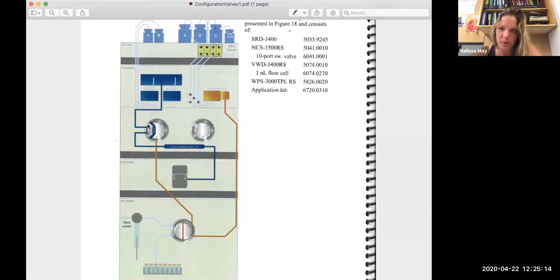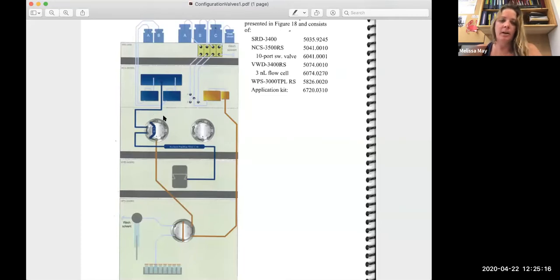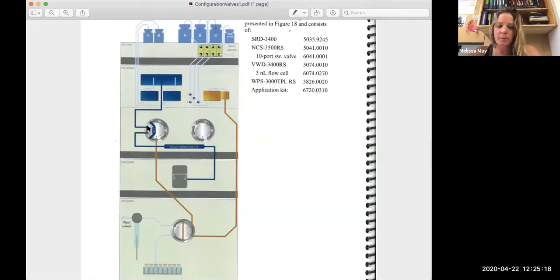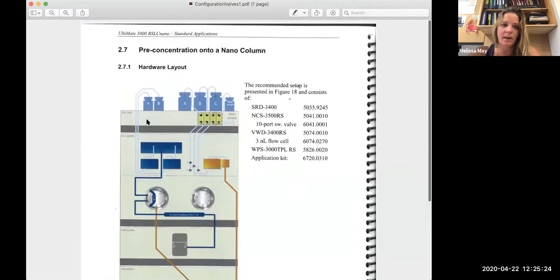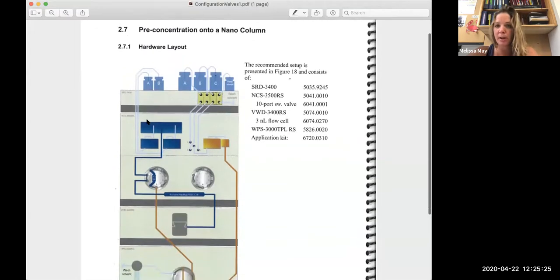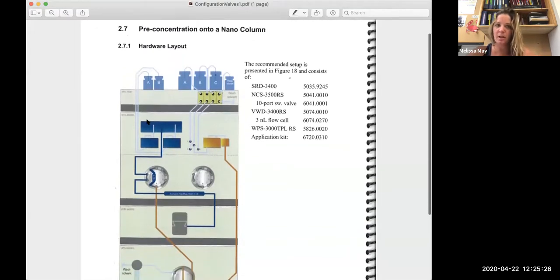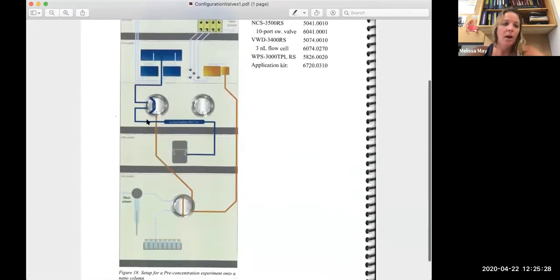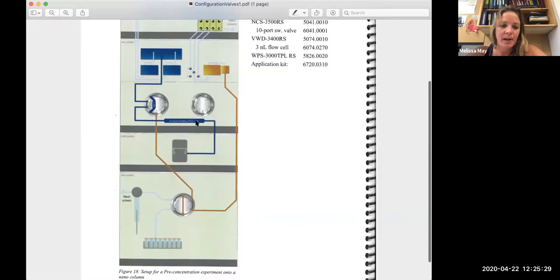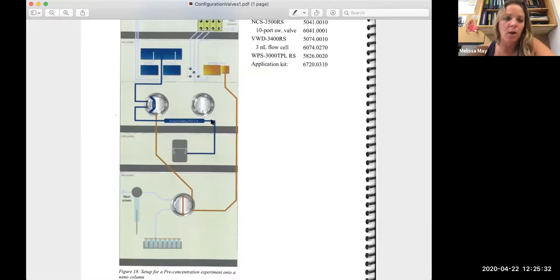That goes into this 10-port valve in the column chamber. In the column chamber, we have two separate columns. So we have the C18 column here, which is our pre-column. And this is the pre-column setup or pre-concentration setup onto a nano column. And then this right here, the Acclaim PepMap, that is our analytical column.